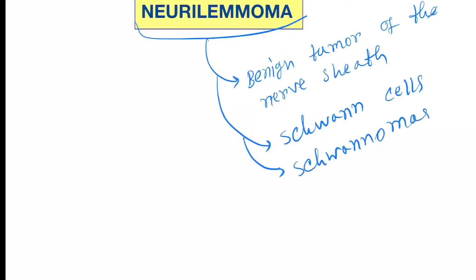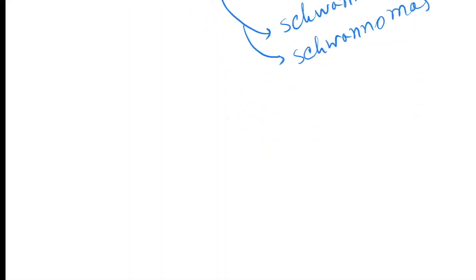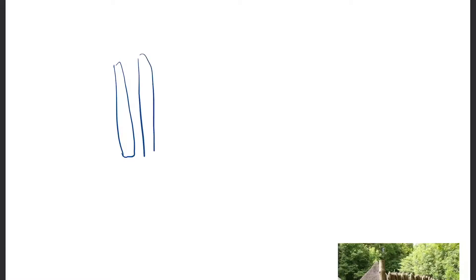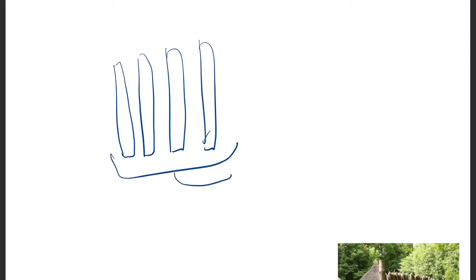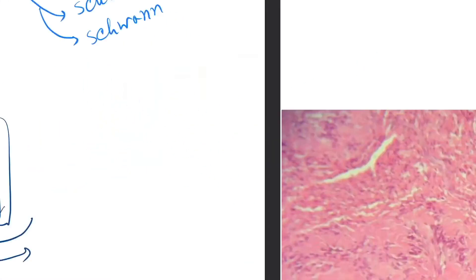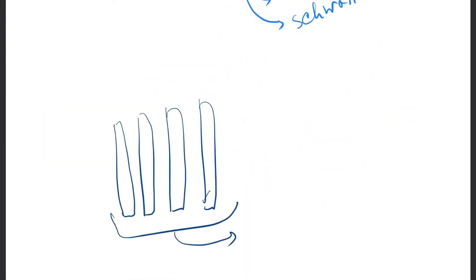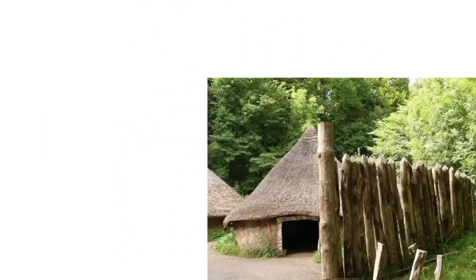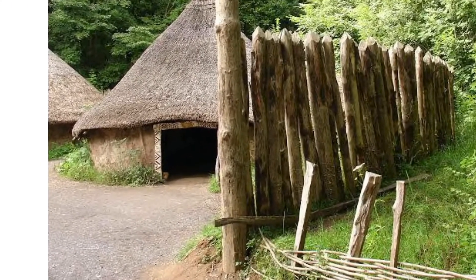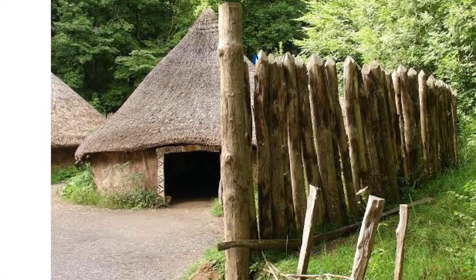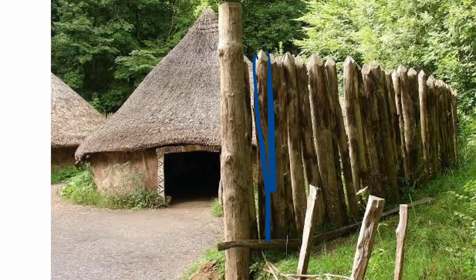Now come to the histopathological features. The nucleus will appear like a rod-shaped structure. These are the nuclei and this will form a palisade here. You can see a palisade or barrier which is formed of lots of rod-like structures, like a wooden barrier.